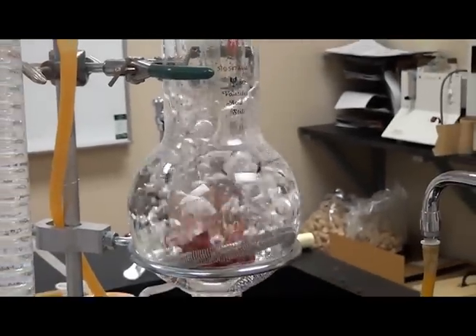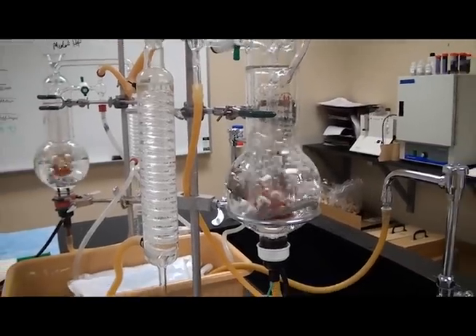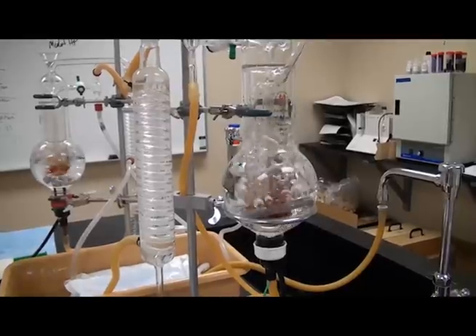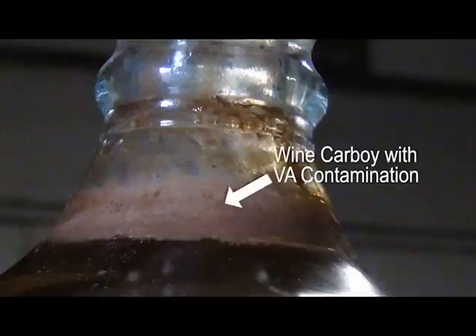Volatile acidity, or VA, primarily refers to the acetic acid content of a wine sample. Often the terms VA and acetic acid are used interchangeably. If the VA level is not detected and managed properly, rising VA levels can quickly turn a wine into vinegar.